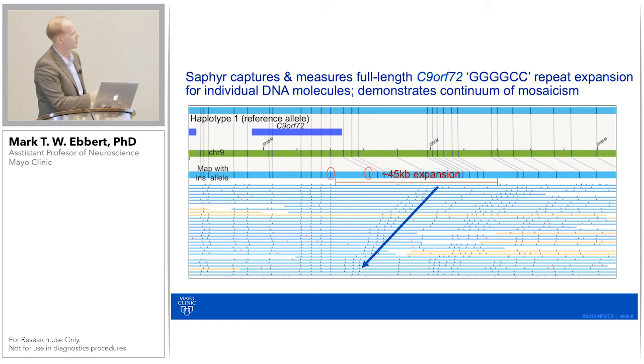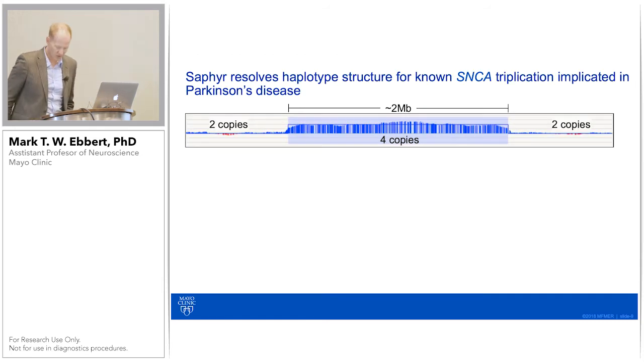So this largest one is 45 kb. And that should give you an idea of just how big these molecules are, because with other technologies, while they have a lot of value, they're fantastic, you're really unlikely to get even a few reads, or you'll get a few reads that reach 45 kb. You're not going to get any reads that can span a 45 kb expansion. It's really impressive.